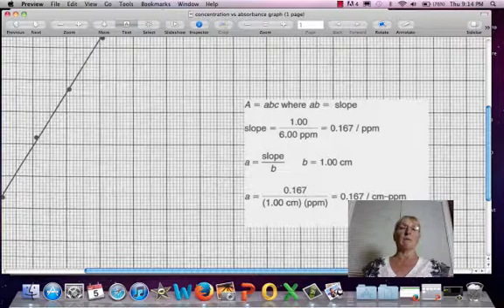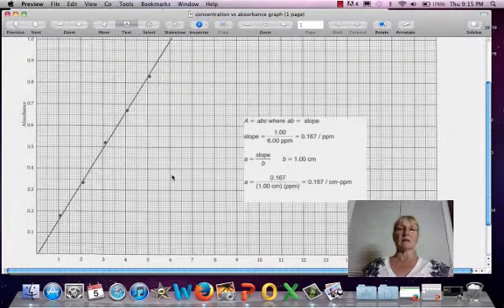And the point of doing this was I did truly want you to understand what's happening inside the guts of the machine. And you should have noticed then, as we increase the concentration of any solution, you're going to see the amount of light being absorbed increase. You could just as easily have graphed concentration versus transmittance, and I hope you would logic out that the more and more concentrated it is, the less light would be transmitted, if that's what we were measuring over here as the dependent variable.